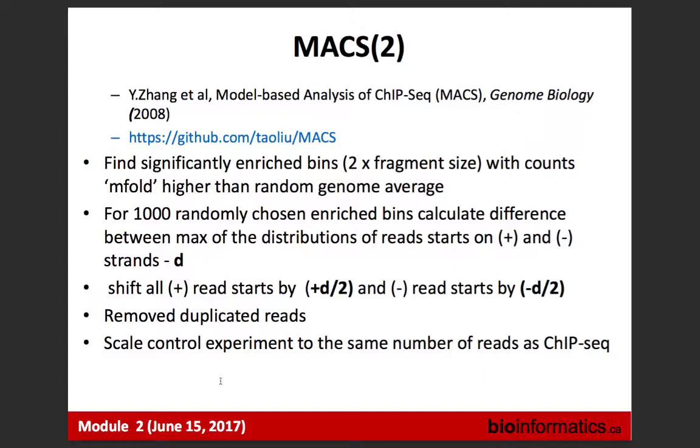The second reason is that it does a job roughly, although more and more people in the field are aware that the behavior of the tool is sometimes odd. But nevertheless, it roughly does a job, especially in the older days when the accuracy of the libraries was not that great. And you can download the tool and run it, no problem. So that's one of the things.